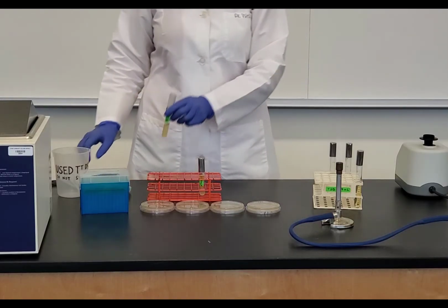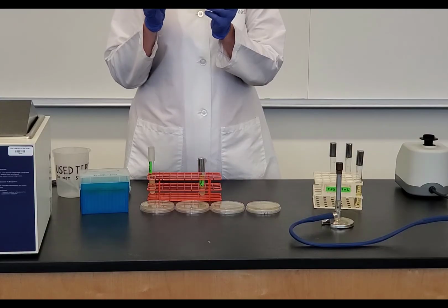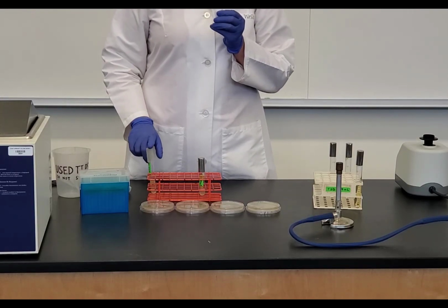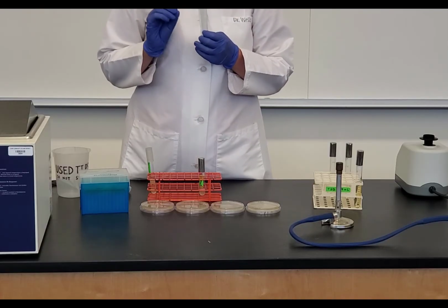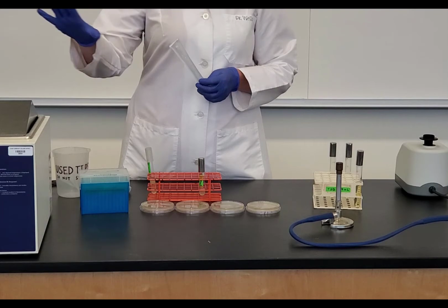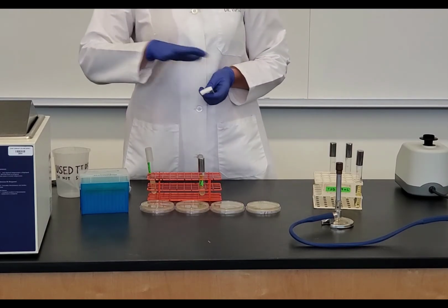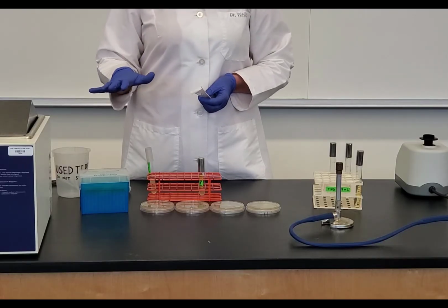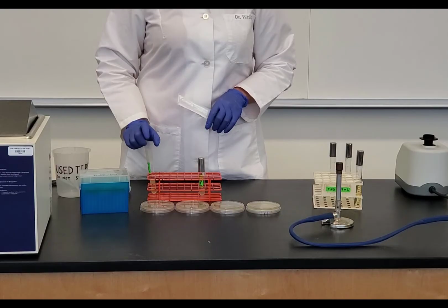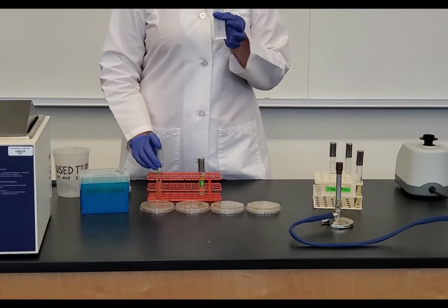So here it is. To transfer the E. coli, I'm going to use a plastic transfer pipette, because the pipetting of this E. coli does not have to be exact. The purpose of the E. coli is that when we mix the E. coli with the melted agar and we pour it, the E. coli is going to form a lawn on that plate. And then the virus is going to infect that E. coli. So for my E. coli, I can simply use my transfer pipette.